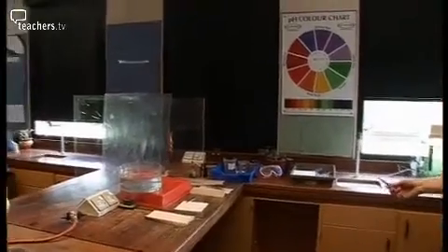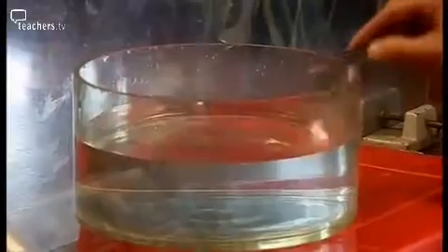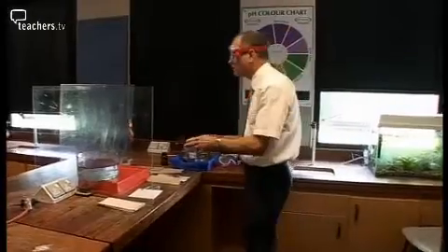Whoa. The challenge is then to explain why their behaviour is similar, but also why it's slightly different. A similarity, please. Brett? They both float on the water and they're both reacting with the water. Good. A difference? One created a flame, whereas the other didn't. Okay. Right, I'm going to pause there, make this safe.